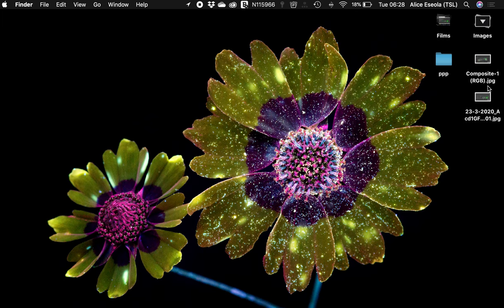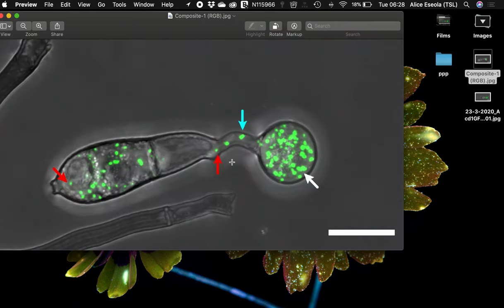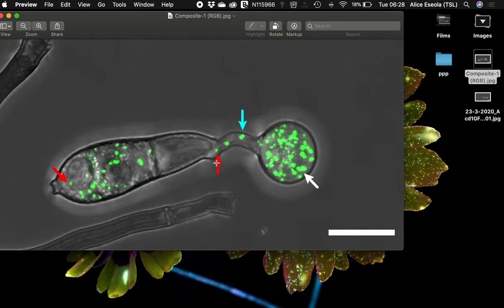Now we can open the image that we just annotated. Here you can see your various colors of arrows. Now if I'm talking about the smaller objects, they are the ones indicated with a red arrow. It's easy for my audience to quickly follow when I see the smaller objects.